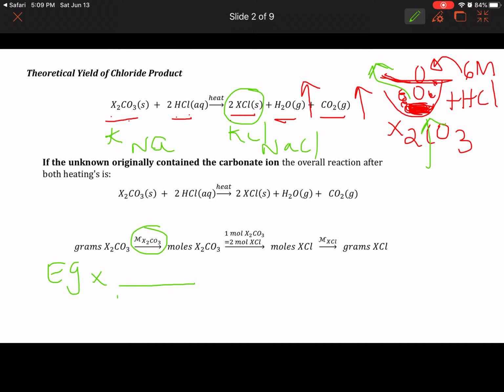So that's going to be M potassium carbonate. You can calculate the molar mass; I'm not going to do it for you, so you can actually participate in doing the calculation. So I'm going to leave it as the mass of the metal carbonate, which is potassium carbonate in our case. But if you had used sodium, then you would use the mass of sodium carbonate.